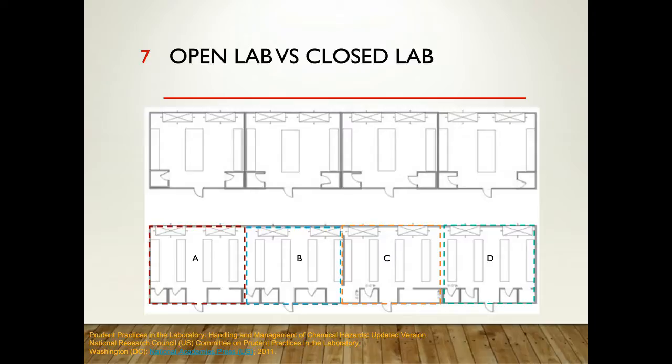The exception to that can be incorporating those separated areas, as I mentioned before. So you can have these open concept rooms with separate subrooms that are dedicated to tissue culture or to pathogen work or radioactive material work. And that helps contain those hazards into rooms with doors that can be locked if necessary, but also keeps it out of the main open area of the lab.